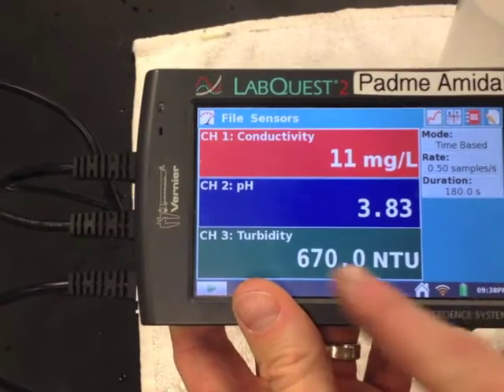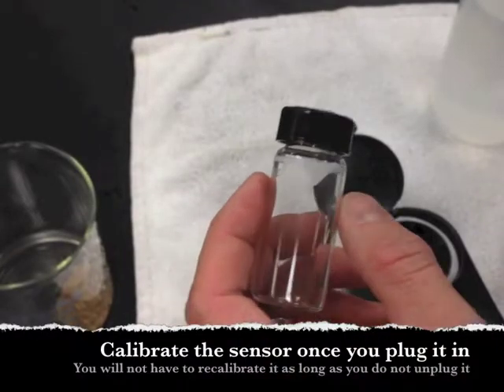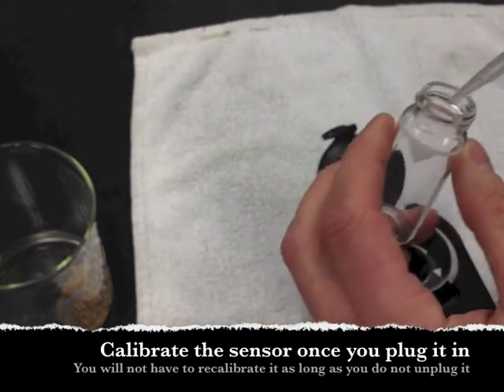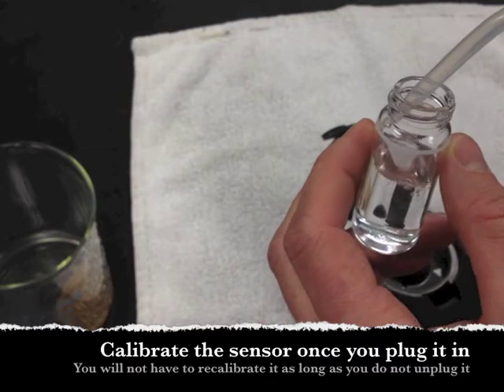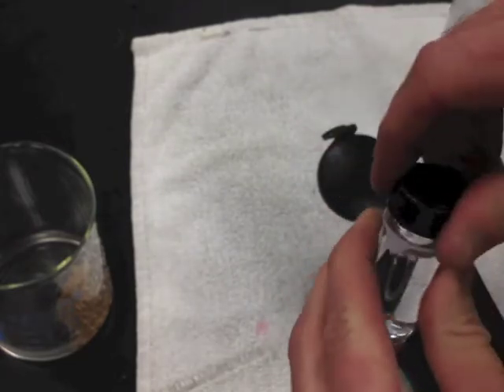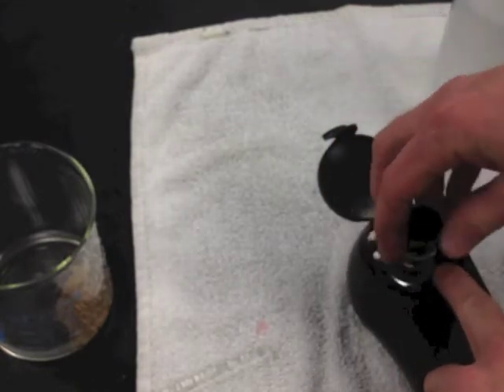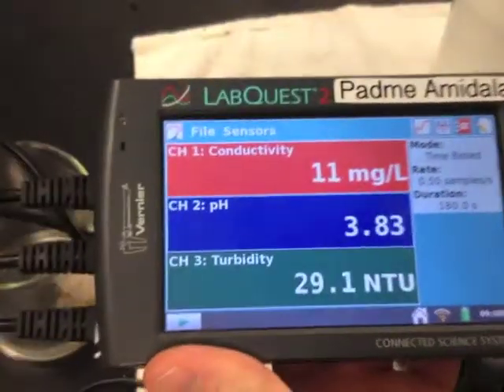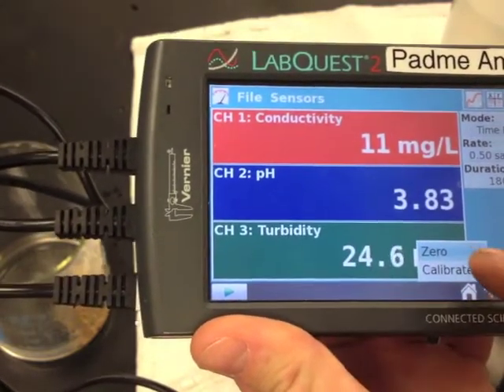Go ahead and plug in your turbidity sensor — we're going to test that next. Turbidity is a measure of how cloudy the water is. To use the turbidity sensor, take a clean cuvette and fill it up with purified water up to the white line. We're going to calibrate the turbidity sensor because it has to be calibrated once it's plugged in. Make sure there aren't any air bubbles on the side of the glass, and line up the arrow with the arrow on the machine. Close the cover. On the LabQuest, tap on the screen where it says turbidity and hit calibrate.